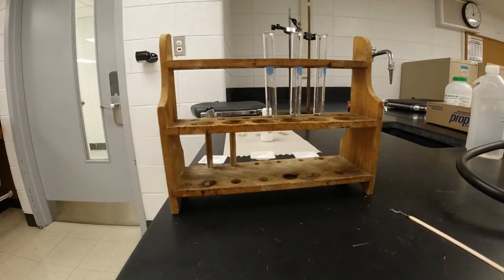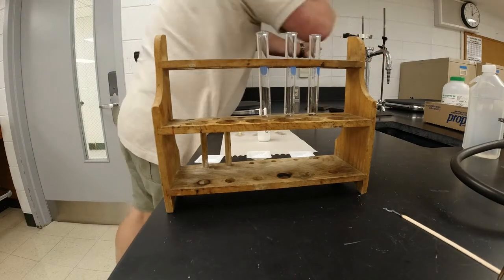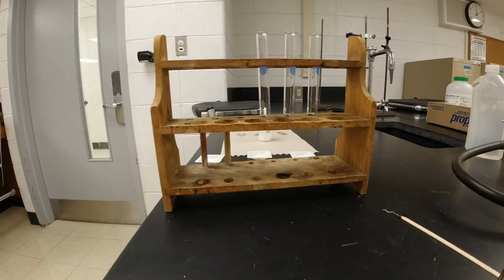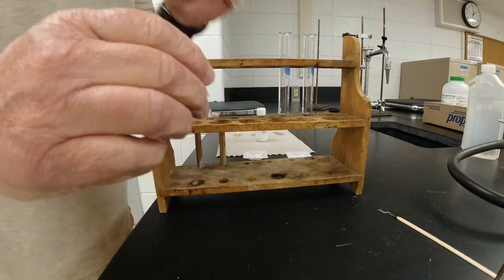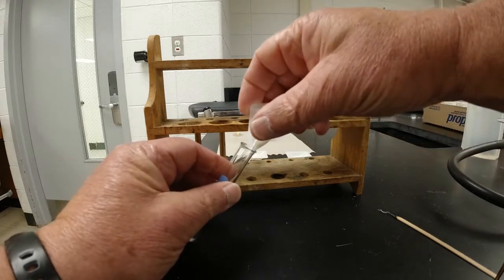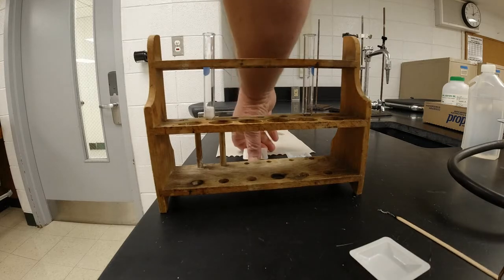So let's tilt that up a little bit so we can see that a little bit better. Step out of the way. All right. So I bend this just a little bit. I don't know if you guys can see that very well, but if you kind of bend those little plastic things, you can pour it all and get all the powder right in there. All right. So there's my magnesium sulfate.